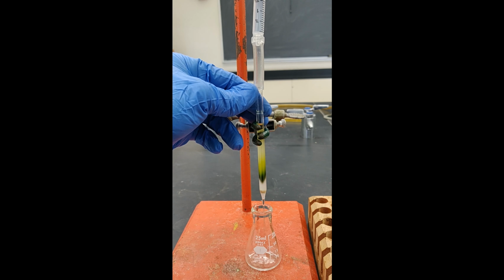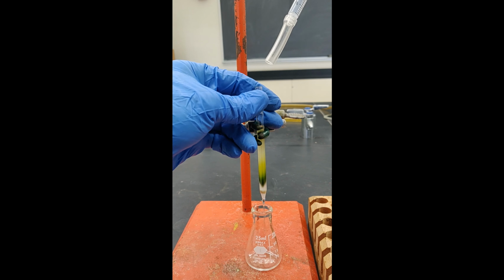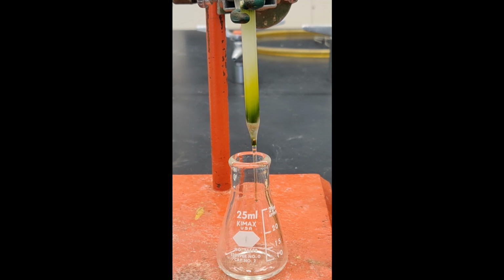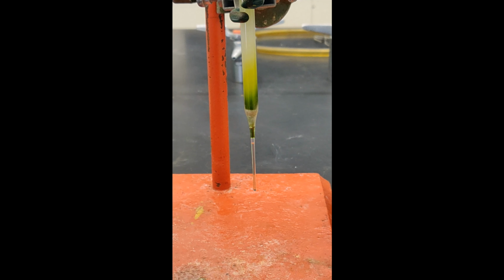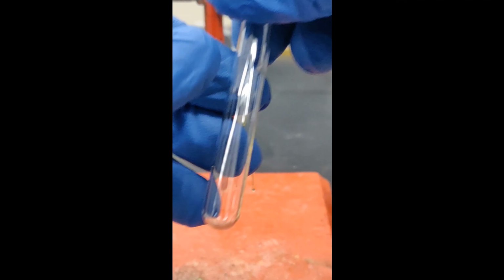Add more ethyl acetate as needed and don't let the column go dry. Using air pressure, the second pigment should elute very rapidly. Collect it in a separate test tube.